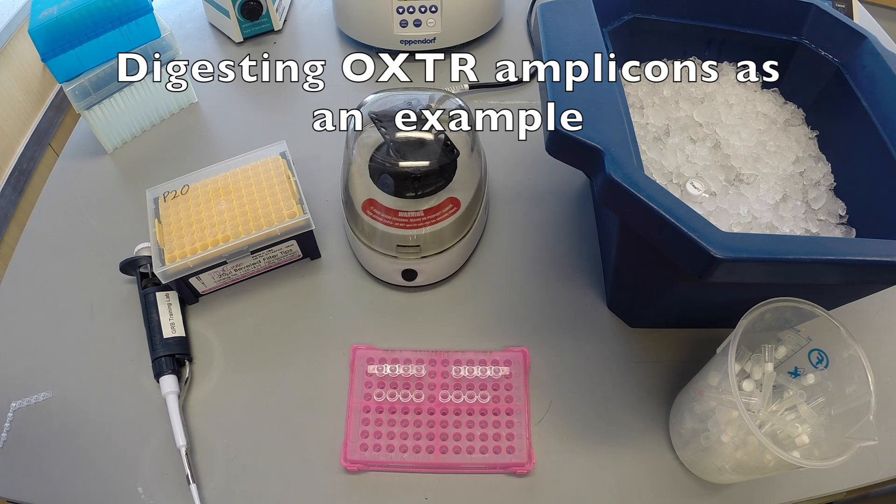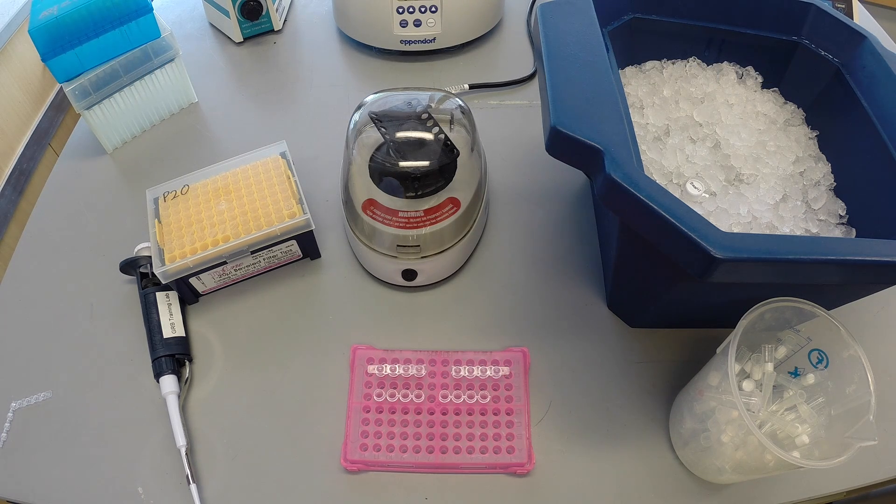In this example, DNA samples in which the OXTR locus has been amplified will be digested with restriction enzymes to determine genotype.